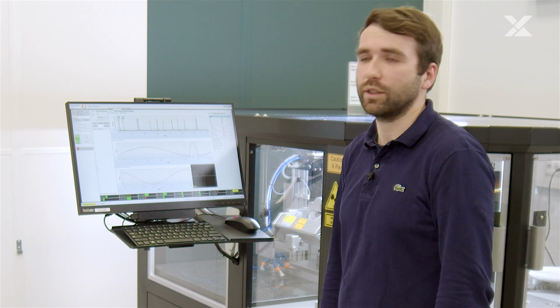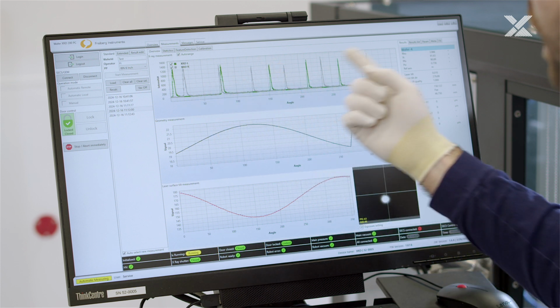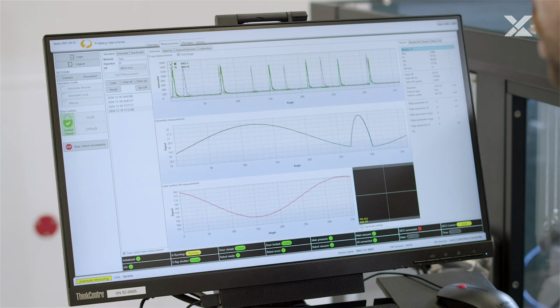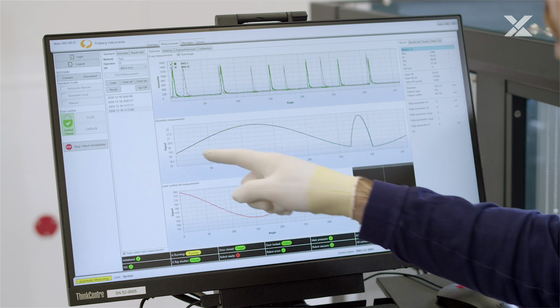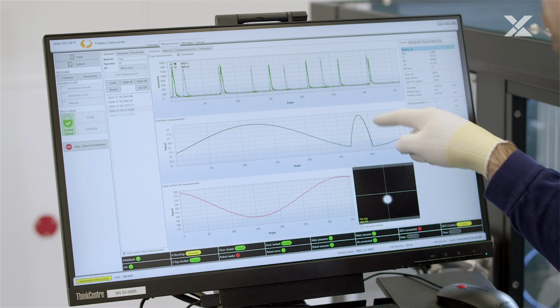the Azimuthal scan algorithm. The screen here contains three important subparts. The first one contains data sets from two different detectors, the gray one and the green one. The second one contains the wobbling curve measured by the Cognex sensor. First of all, from the wobbling curve, it is possible to identify the diameter of the wafer and properly center it. The second, we can see the profile of the wafer feature.